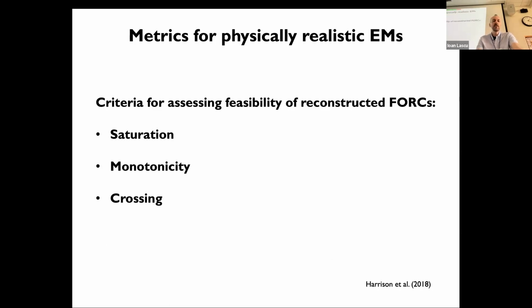And each of these feasibility metrics has a value of 1 where it's perfect. And you can use them in combination. You can use 1 of them, 2 of them, 3 of them, and you multiply each other. And then you can plot contours on top of the unmixing space. And we'll see how to do that.